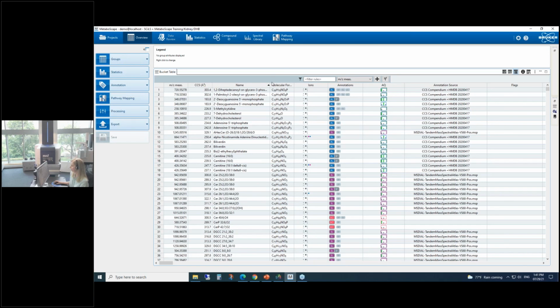I'm going to come back to some of this additional information in the annotation, because first I'd like to also point out to you this column that says ions on it. This is one of my favorite things because it takes my data, which may have multiple representations of the same ion, say a protonated, a sodium adduct, and a potassium adduct, and it's deconvoluting that so that I only have to look at one line of information for each type of peak or for each potential analyte overall.